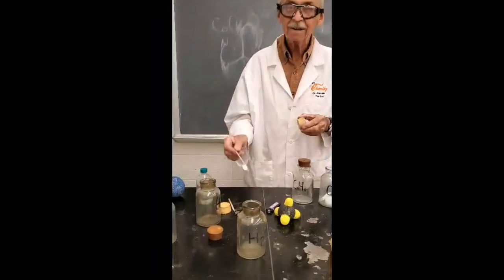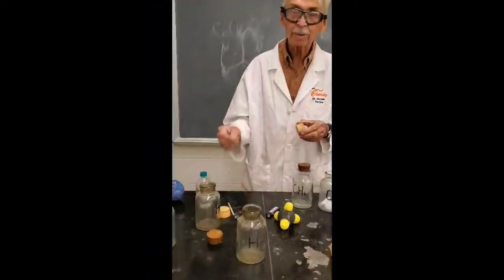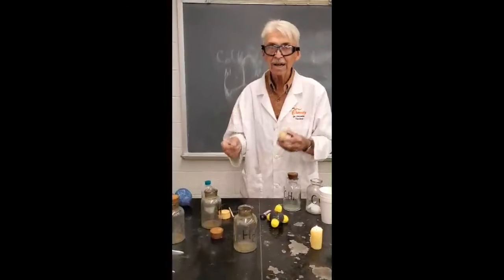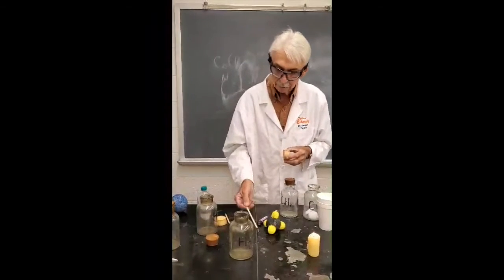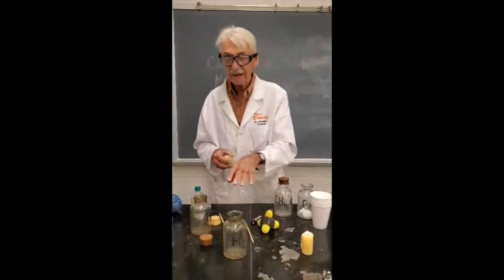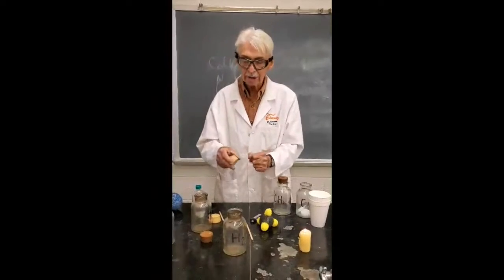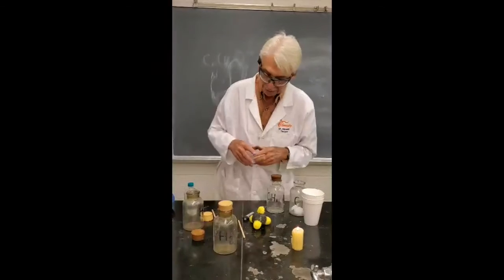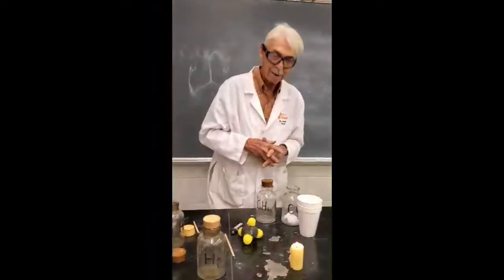And that is called an explosion because the hydrogen came out and mixed in with the oxygen in the air, so when it lit, it exploded with a mild explosion. Now, if we'd done that same thing in an atmosphere of pure oxygen, it would have been a much louder explosion. Now, let's see. What's the formula of water? Anybody remember?